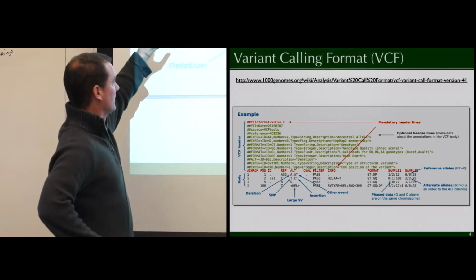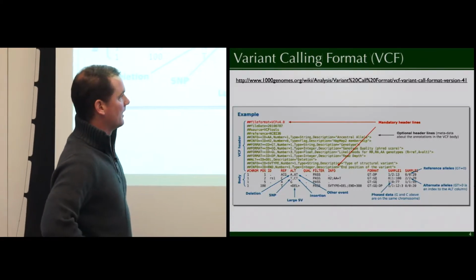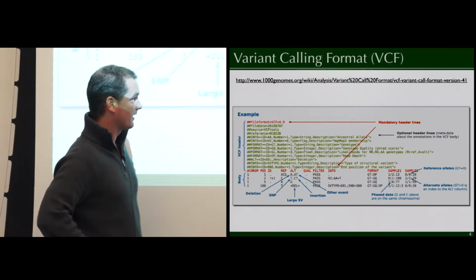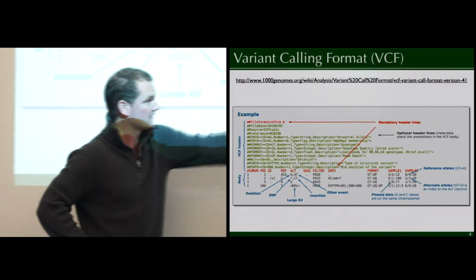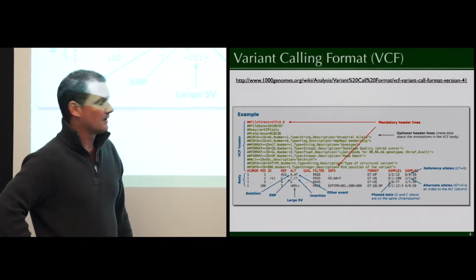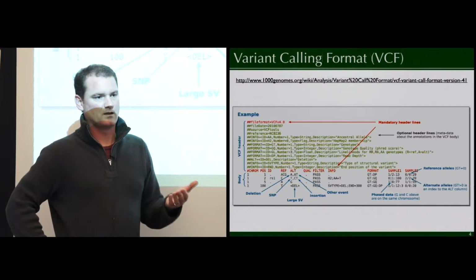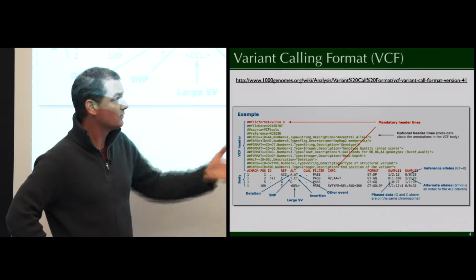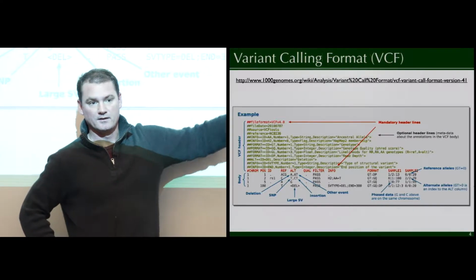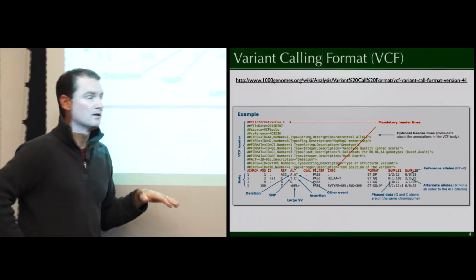So you have a chromosome, you know the position, you know the reference and alternate allele, you know whether or not it was flagged as a potentially suspicious or dodgy variant, and you know the genotypes of the individual. So if you're studying a Mendelian disorder, and you think it's an autosomal recessive inheritance pattern, you could use the genotypes, if you had them for mom, dad, and the proband, to just look for variants that meet a recessive inheritance pattern and filter things down that way.